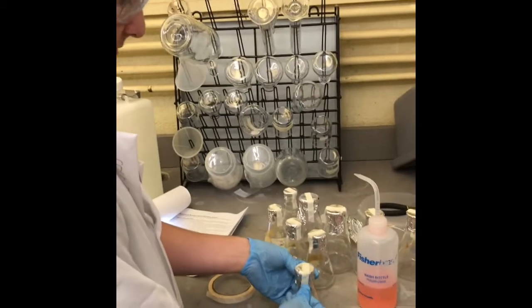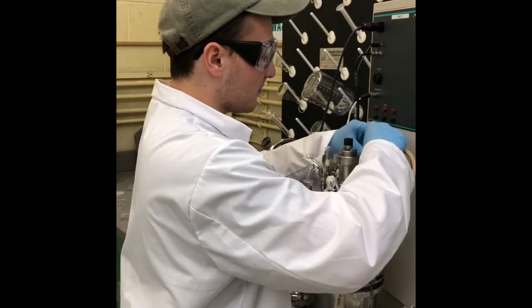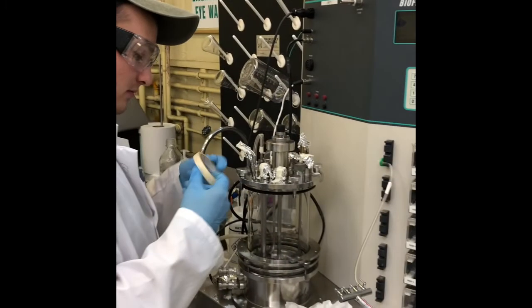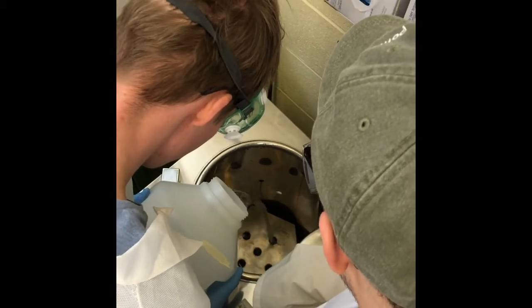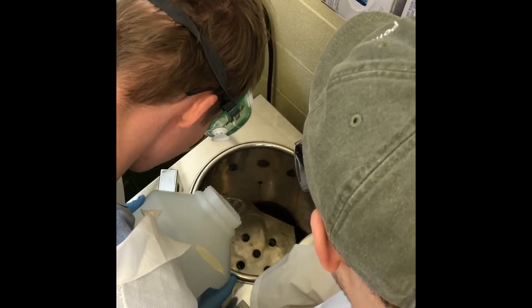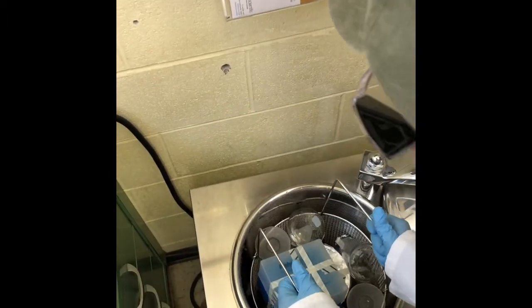In addition to the glassware, the bioreactor was also cleaned with DI water and soap. Any opening on the bioreactor was also capped with aluminum foil and had a strip of autoclave tape. This kept contaminants from the atmosphere out of the bioreactor. Enough water was added to the autoclave to ensure that the plate was covered with water. Any glassware used in the experiment was then placed in a basket, which was then placed in the autoclave. We then tightened the lid to the autoclave.